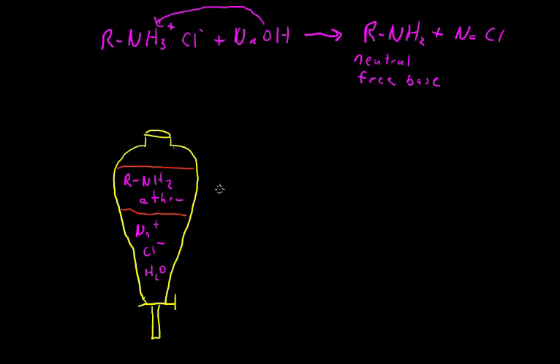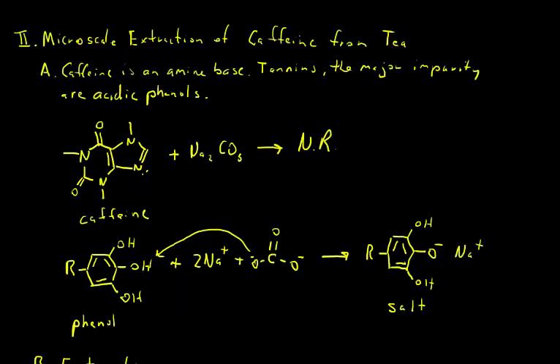And so anytime you've got an amine, this is often a very effective and very easy way of purifying amines. So we're now ready to talk about the microscale extraction of caffeine from tea, which is of course what we're doing in the experiment in the lab.